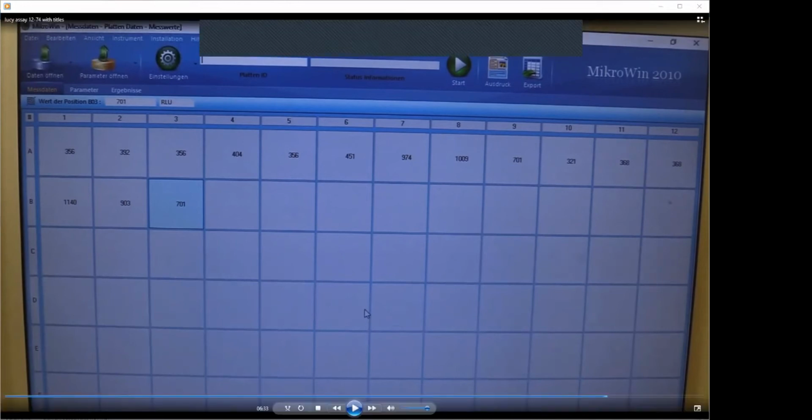So what we see here are 3 times not transfected cells, 3 times transfected, but only with the reporter. Then we have 3 times transfected with the same reporter, but treated with lithium chloride. Then we have the same, but transfected with T7. And then we have 3 times transfected with the reporter plus co-transfected with beta-catenin.